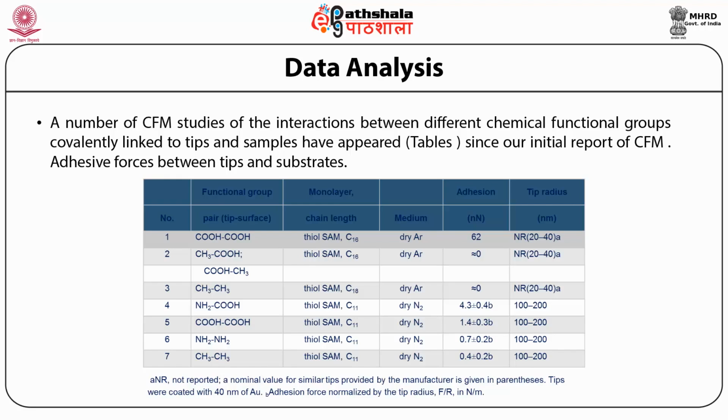A nominal value for similar tips provided by the manufacturer is given in brackets, which are taken as standards. Tips were coated with 40 nanometers of gold, and adhesion forces normalized by the tip radius, F by R, have been given in terms of N per m.